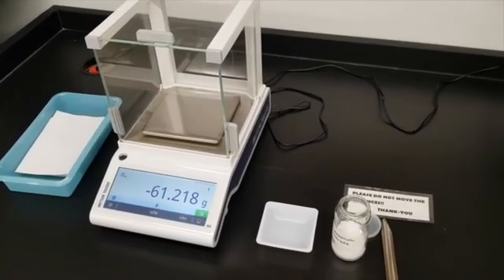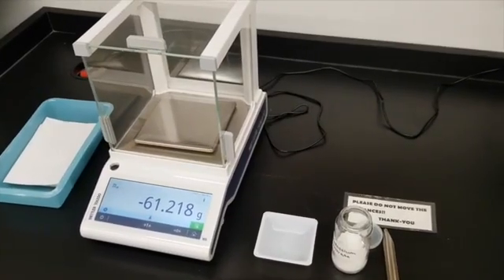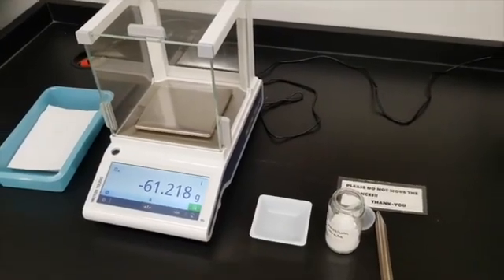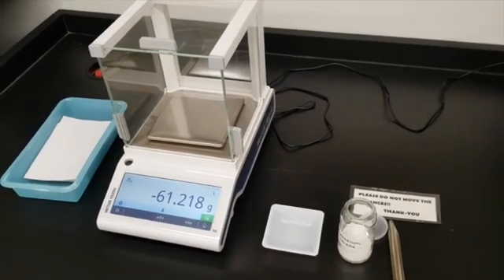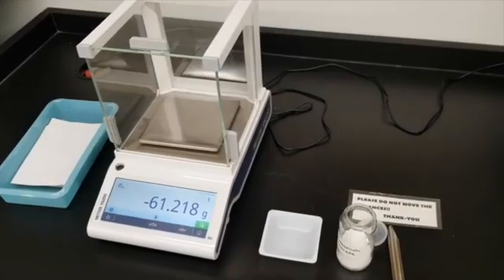So we're basically going to dissolve our potassium nitrate in 5 milliliters of water, and then see at what temperature, as it cools down, it crashes out of solution. That's the point at which your solution is saturated.